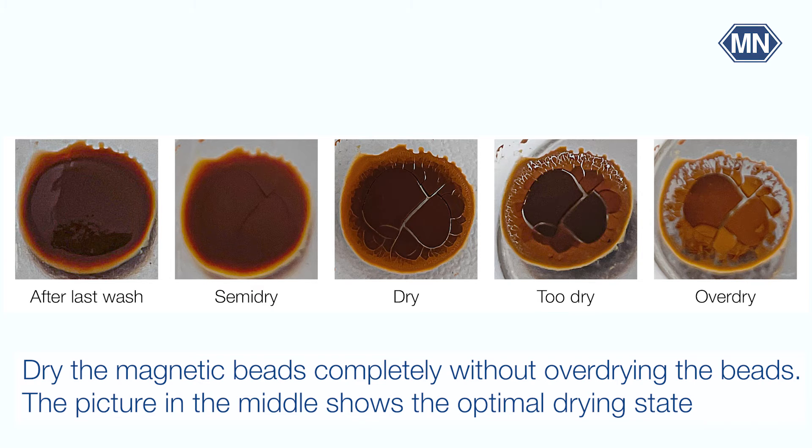Here you can see the different drying states, while the one in the middle shows how the beads should look like.